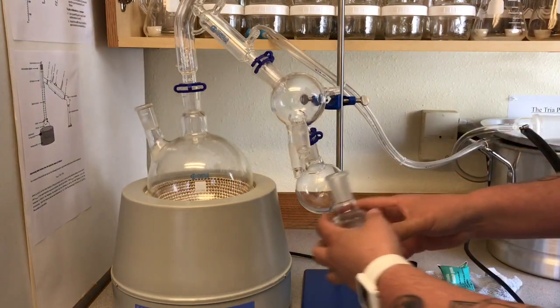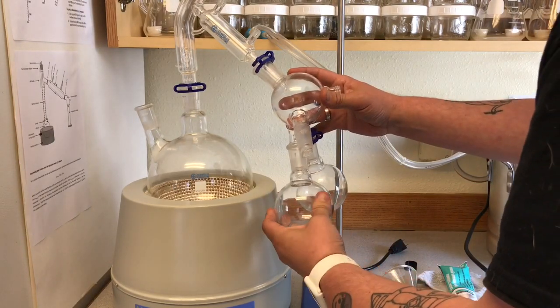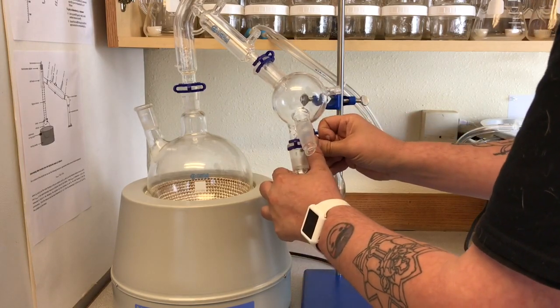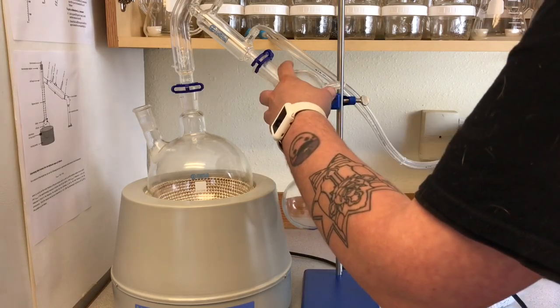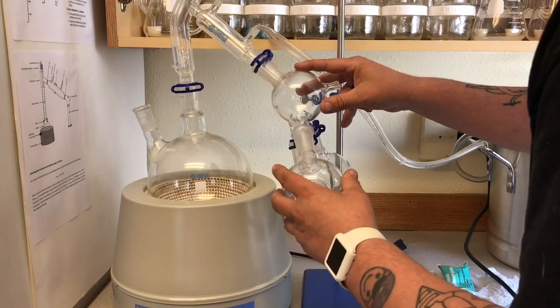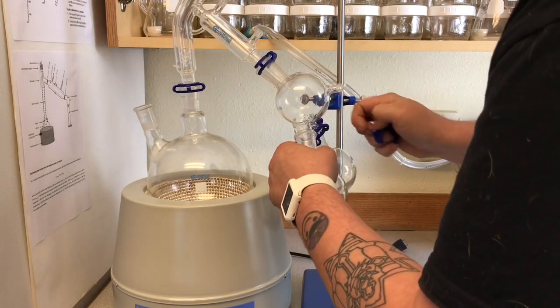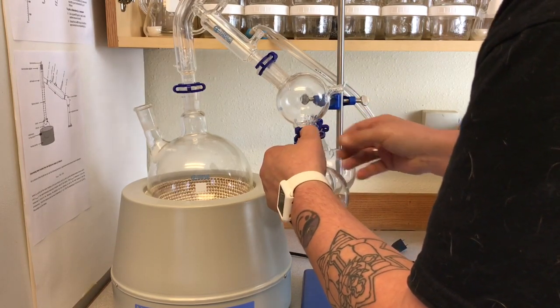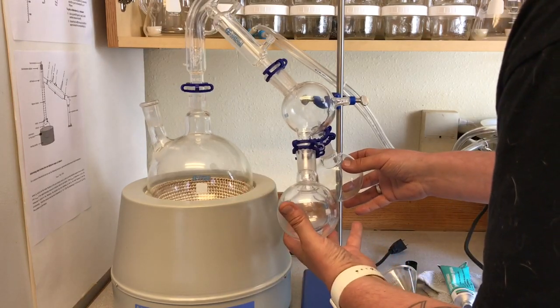And there will be three collection flasks. So when we're doing our distillation, we're going to have a head, a body, and a tail. The head is going to be those molecules that evaporate at lower temperatures. The body is going to be a light colored oil, and the tail is going to be when the light color in the oil starts to turn a darker color.